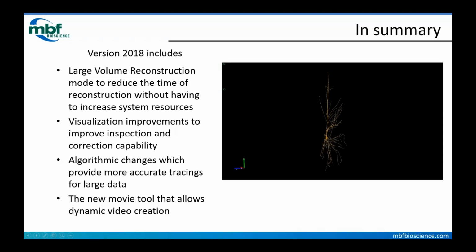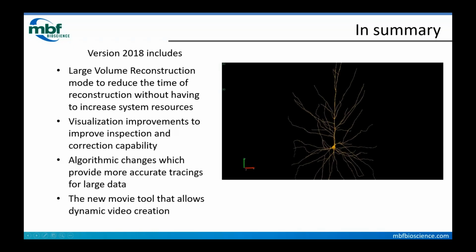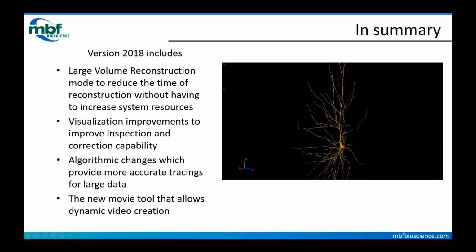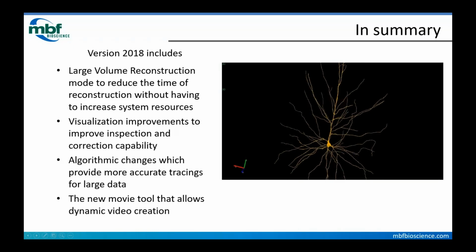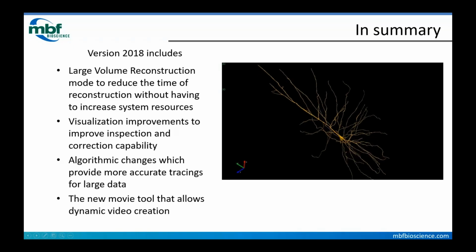So we hope that you find that to be helpful as well. And so as your data gets ever larger and more complex, we're going to be innovating right alongside you. This release is just the first iteration of planned efforts to accommodate even larger data sources that we see come in. We look forward to providing you with updates throughout the year. Thank you very much for your time and attention today.